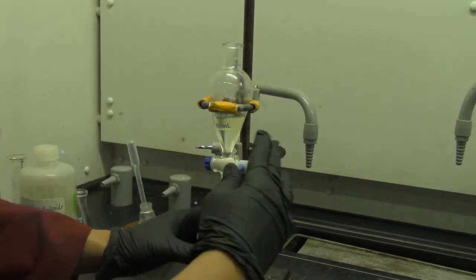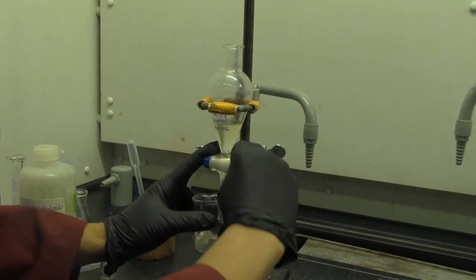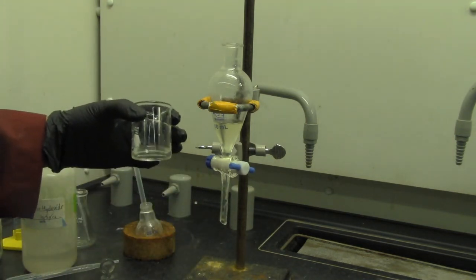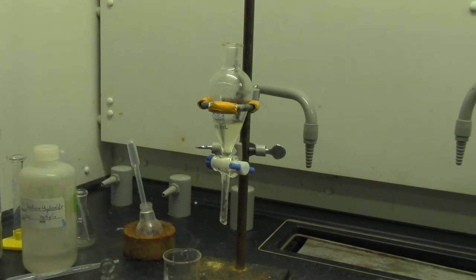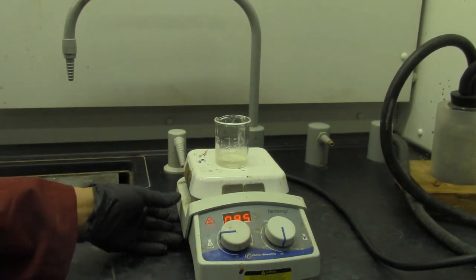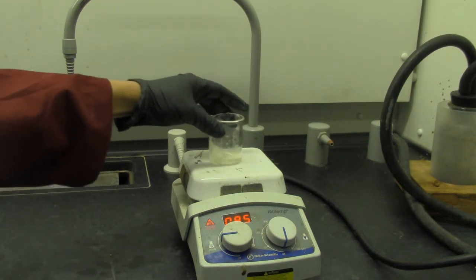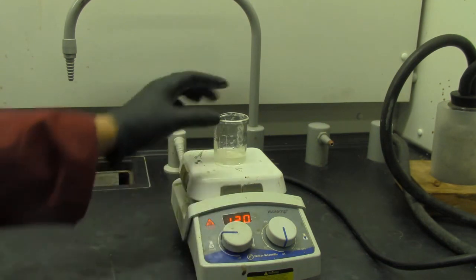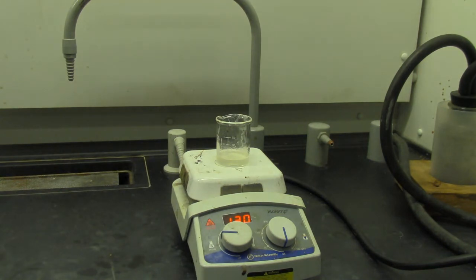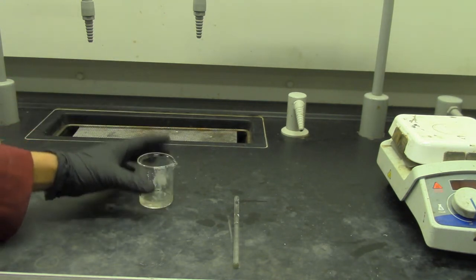So drain out the bottom layer. So what's in the bottom layer? And what is in the top layer? So I'm going to save this, right? So now I take the bottom layers in a beaker and I'm heating it gently to remove any traces of ether, right? So just gently. So this will take a while. So after heating about 5 minutes, I let this beaker cool to room temperature.